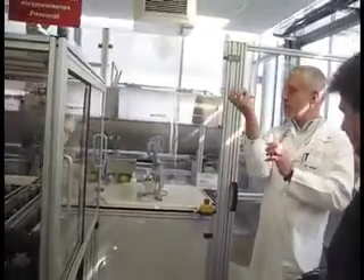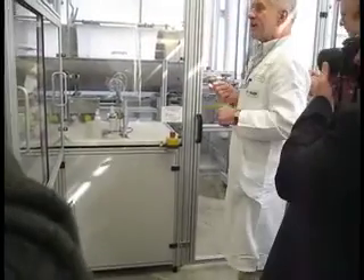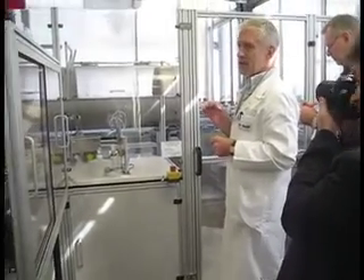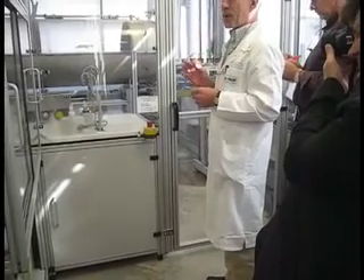In other words, it's moving this way and the spray arm is moving this way. In that way, we apply in fact a very, very low amount of compound, but the plant is correctly sprayed.